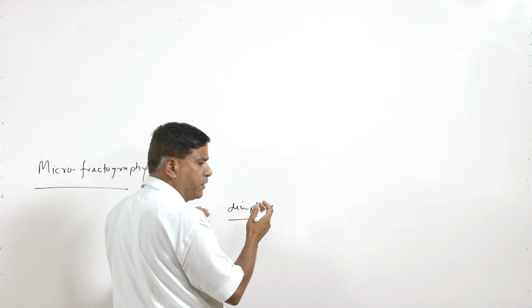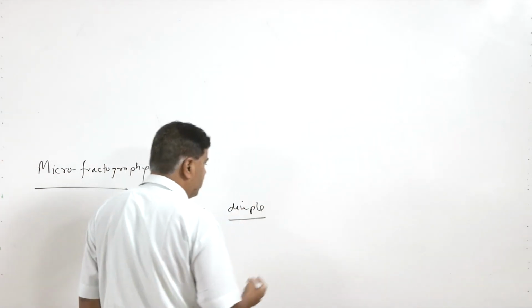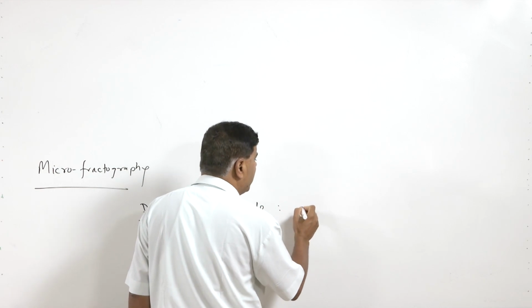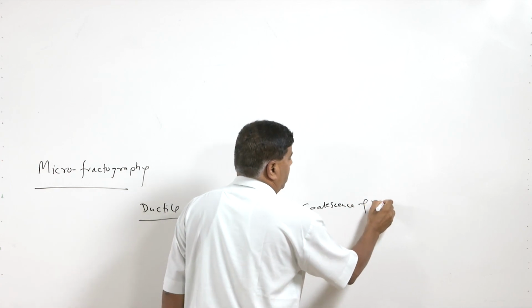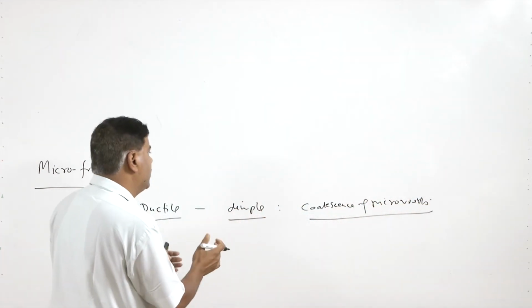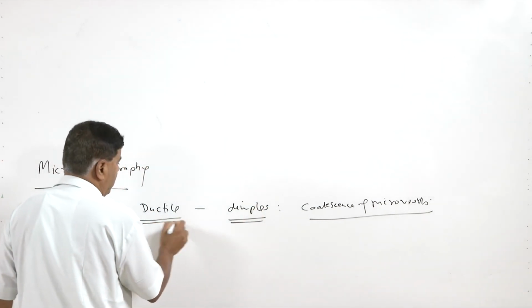So, one feature which is generally obtained in ductile fractures, which involve a lot of plastic deformation prior to the fracture, is the formation of dimples, which is nothing but the coalescence of the microvoids which are nucleating. Whenever this mechanism is involved, it leads to the development of dimples on the fracture surface, and this leads to the ductile fracture.